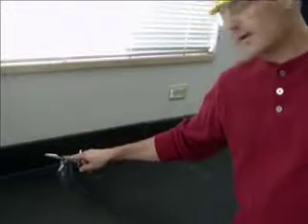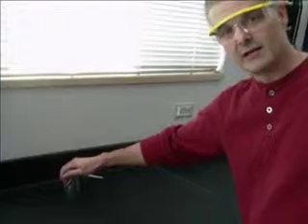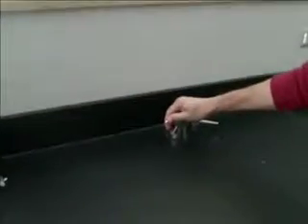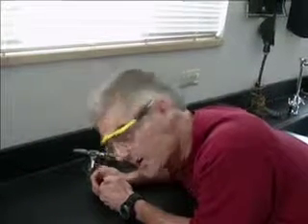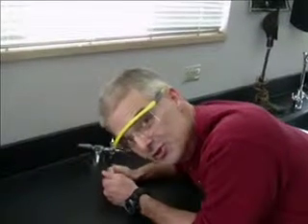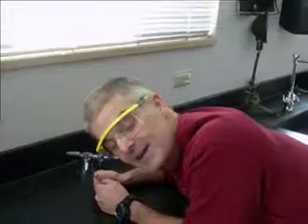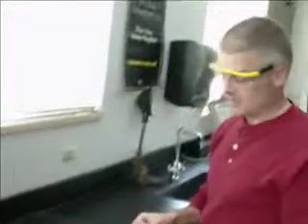I happen to have a gas jet right here, and this has natural gas, or methane gas, coming out of it. I can turn the gas on, and I don't know if you can hear, but it's now hissing. What the student did is he had a lighter. He was a smoker, and he said, Mr. Bergman, what would happen if I did this? And he had his face right in front of the gas jet with his lighter. Well, I'm not going to put my face right in front of it as that student did. Luckily, I screamed loud enough that he did not do what I'm about to do. So we're going to do this on a much safer basis.